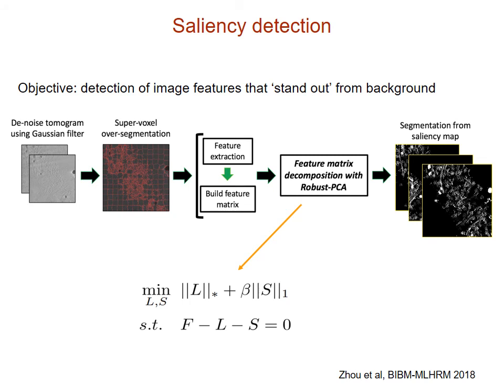In addition, we have developed saliency detection methods to identify the regions that stand out from the background, so that we can significantly simplify the segmentation task by only focusing on such regions.